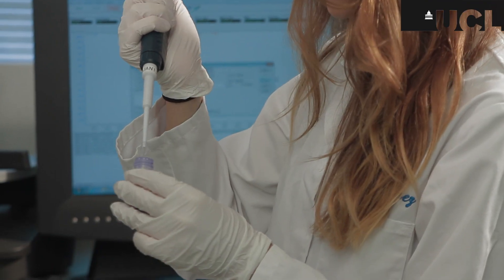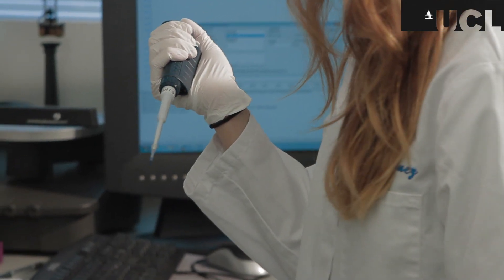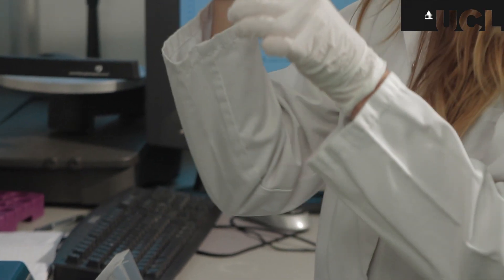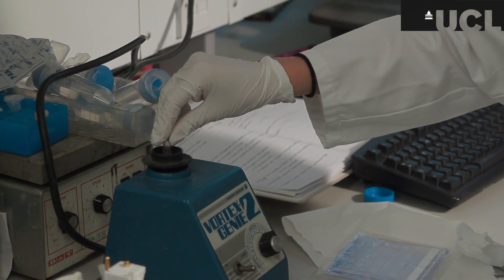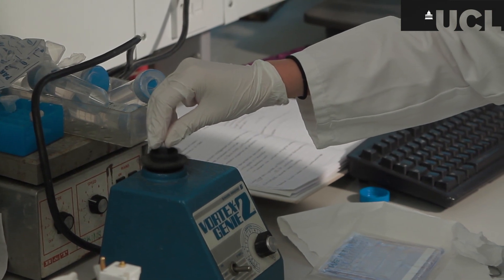To each of the samples I add a reducing agent as well as a dye; this also helps the protein sample to sink in the gel. We vortex the samples to ensure that all of the contents are thoroughly mixed.